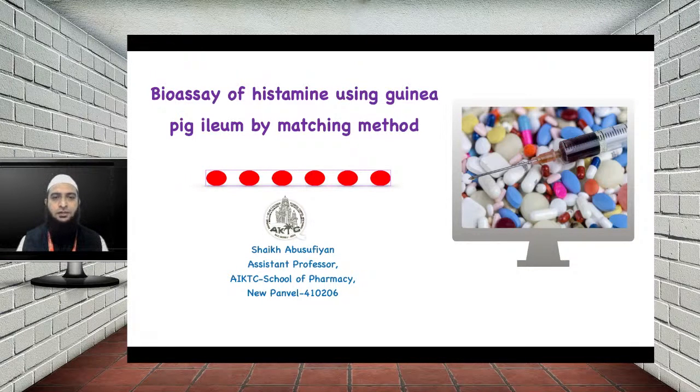Today we'll study about bioassay of histamine using the guinea pig ileum matching method.